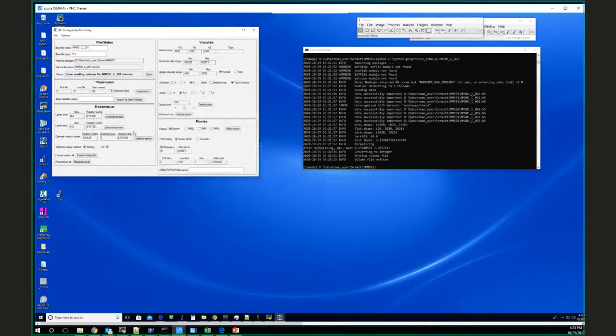And what it says is that it found the rotation center in the upper slice at 970.5 pixels and in the lower slice at 970.75. So they're a quarter pixel apart. That is definitely good enough. And what it's going to do now when I say reconstruct all the slices is interpolate the rotation center and extrapolate so that it uses the variation of the rotation center with height determined by these two points. If it was off by, you know, more than a pixel, then I would fix it by pressing this button, which says correct rotation tilt.